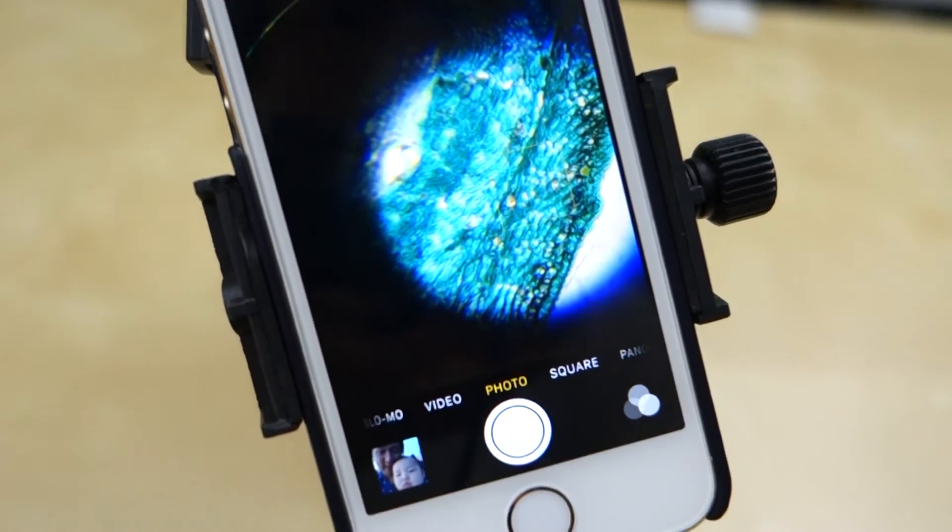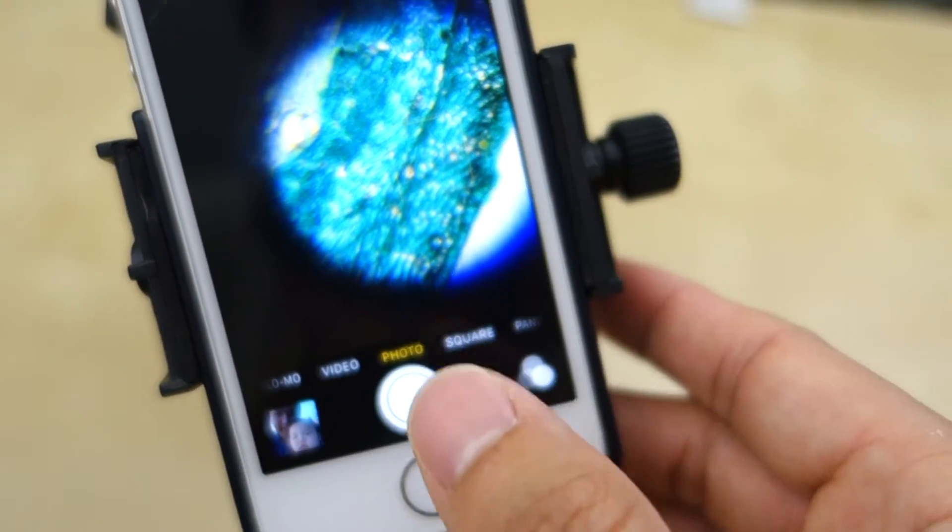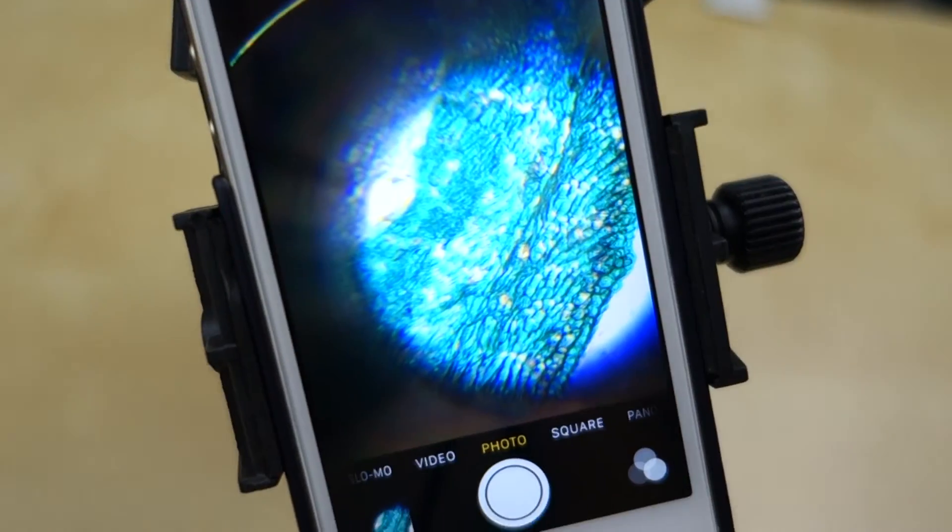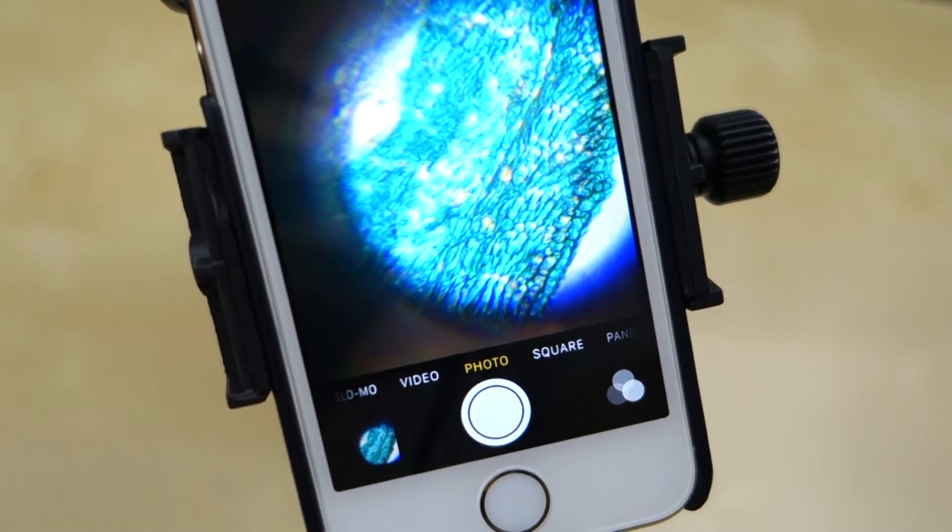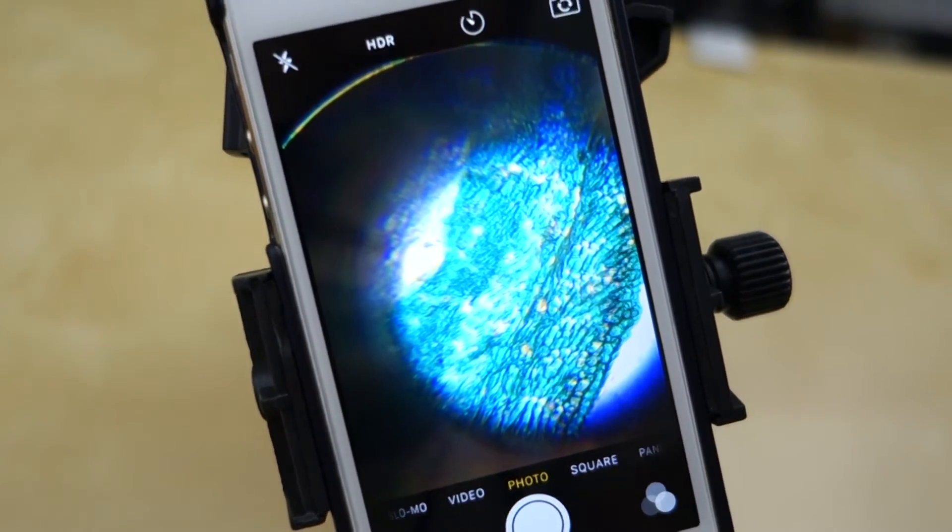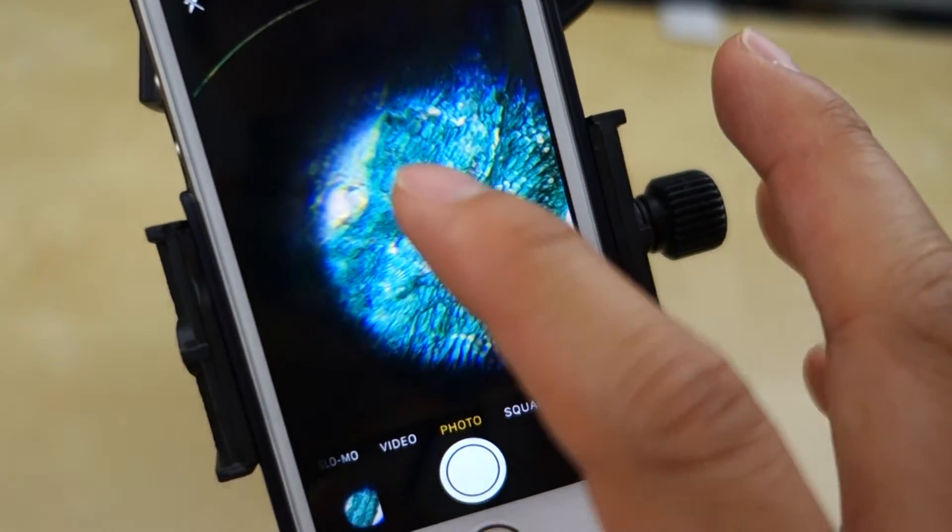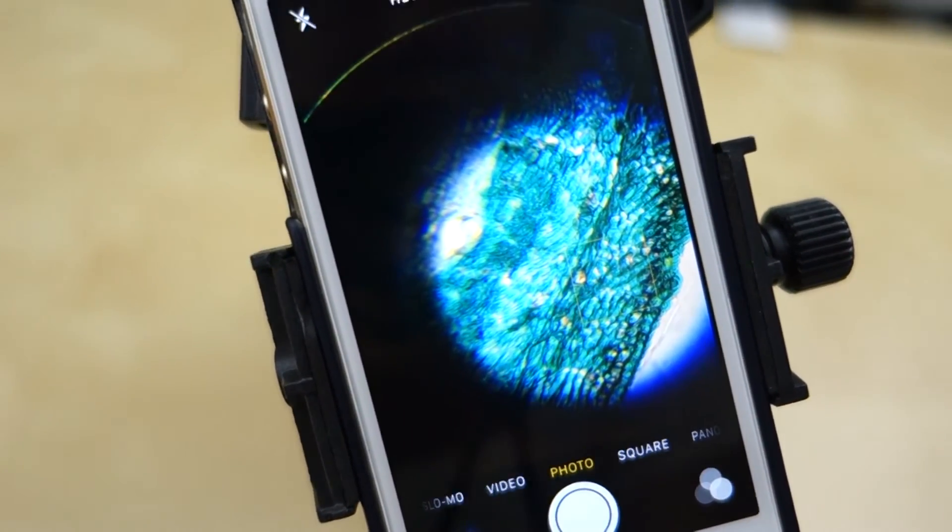So this is the slice here of the onion, as you can see. Kind of give you an idea. And then of course you can take the picture or whatever with your camera. You're not going to get a full view because of the small eyepiece. So I do wish that they have a little bit bigger eyepiece. That would be nice for the camera. They also make a camera adapter that I've actually reviewed in a digital camera. I have not reviewed that yet. But it just seems to be pretty okay. You can get some pretty cool neat pictures.